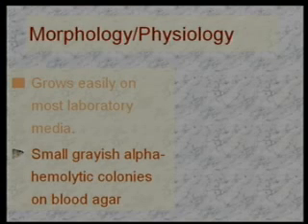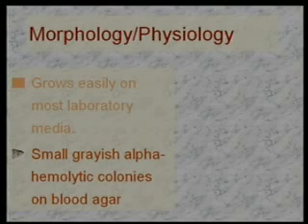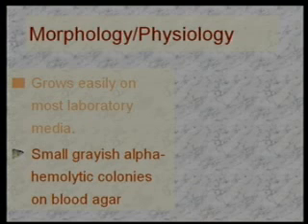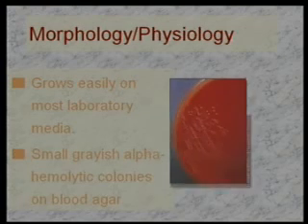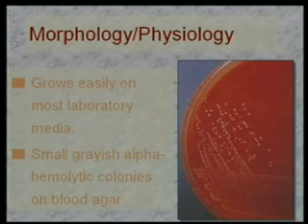Remember that alpha hemolytic is the diffuse sort of partial lysis of red cells. So it's alpha hemolytic as opposed to strep pyogenes, that is beta hemolytic, or Listeria, that is totally hemolytic. This is alpha hemolytic. Okay, here is a faint lysis around the organism.